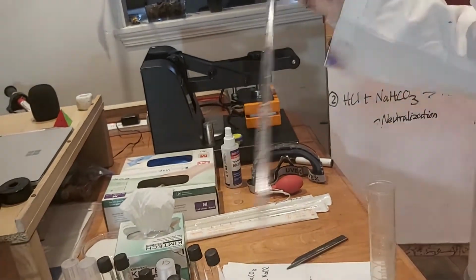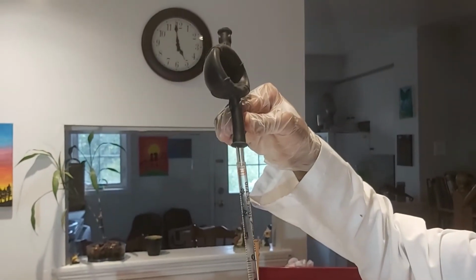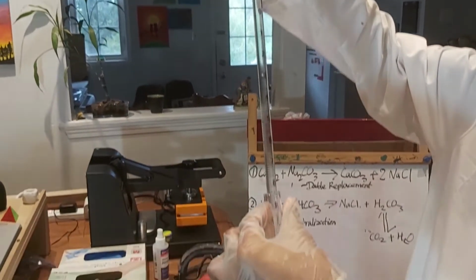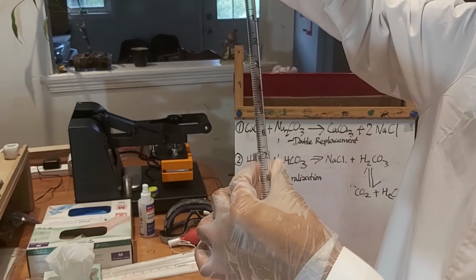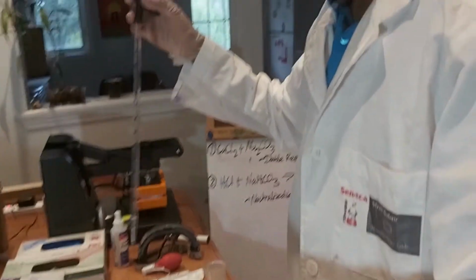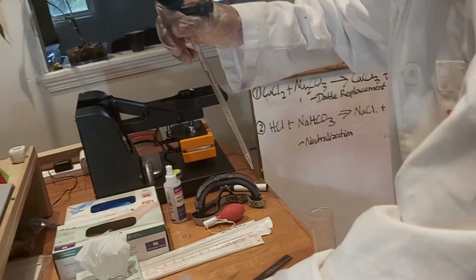Now we have a test tube. We're going to eject this all into the test tube, including the last little bits. We're going to put a cap on it first and leave it aside in the test tube rack.